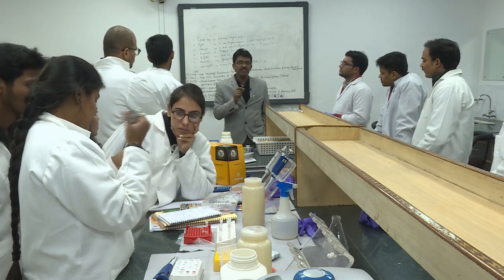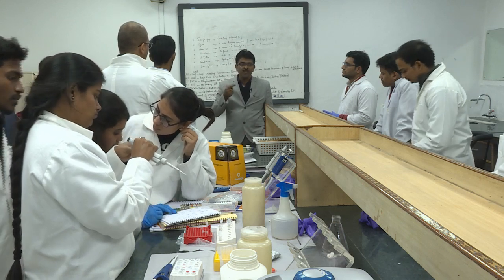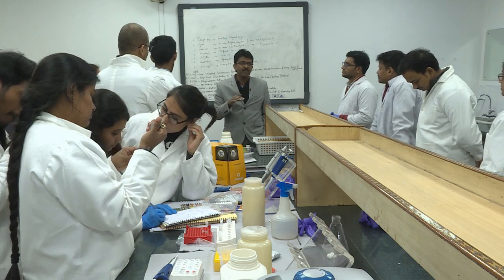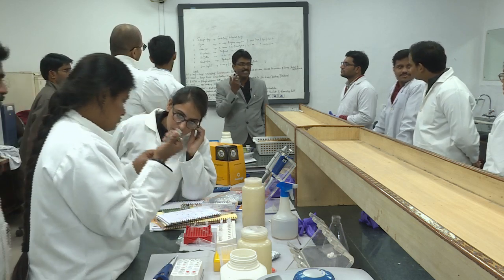Okay. Second thing, normally we go for the culturing in a broth with a constant shaking of 150 RPM for about 3 days. And you will see the fungal balls which are emerging, right?